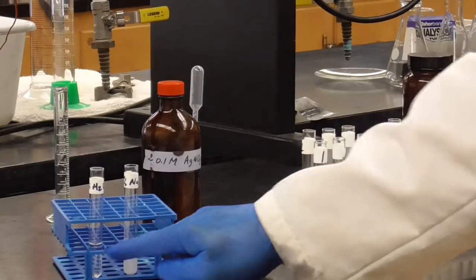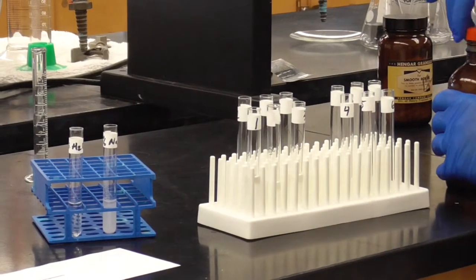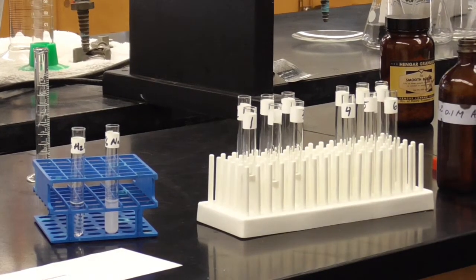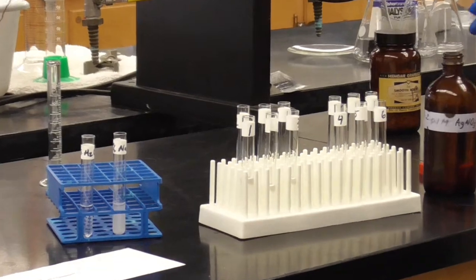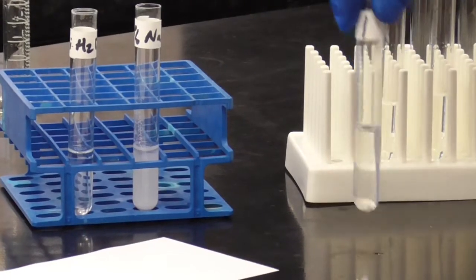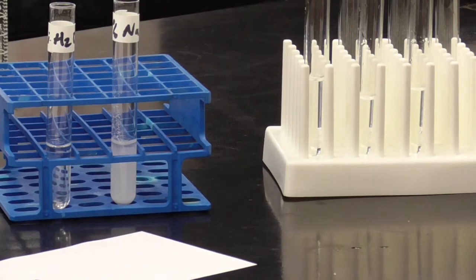You remember what the negative and the positive control looks like for the chloride test. And all we did is dropped 2 to 3 drops of the silver nitrate in there, and we saw it right away. So there we go, the silver nitrate test here. 1, 2, 3, dropped it in, and not much happening at all. It looks very clear. Again, compared to a positive test, I mean, negative for chloride. So nothing has made it through, and no chlorides have made it through at any rate.